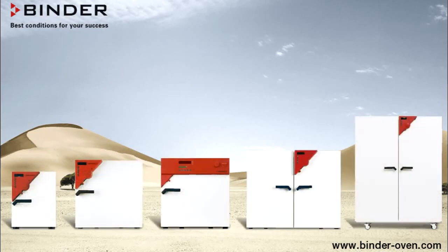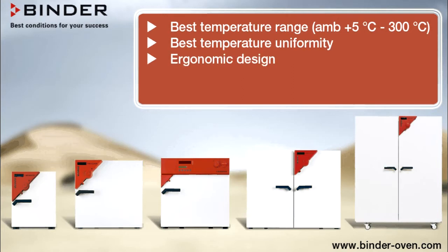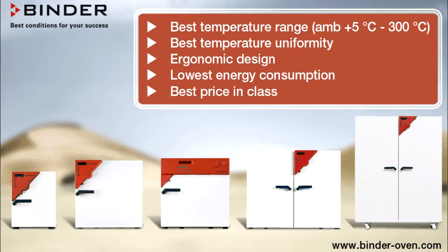With Binder, now you can find the right oven for your laboratory research and industrial product and component testing applications. Binder Ovens offer you the best in temperature range, temperature uniformity, and ergonomic design while saving a lot on energy for a surprisingly low price.